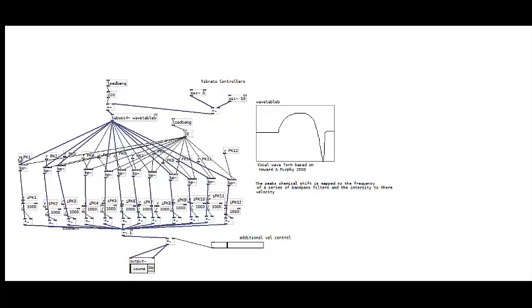The filters are each set by these, their intensity by that, and then finally it's summed and outputted here. So that's the final design, design 4. All 4 of these designs that you've seen now were then taken and used for our first user test to determine which the chemists believe will be the best going forward.